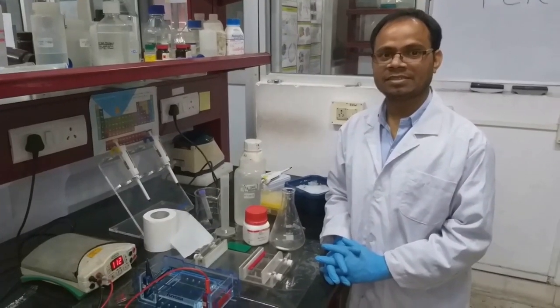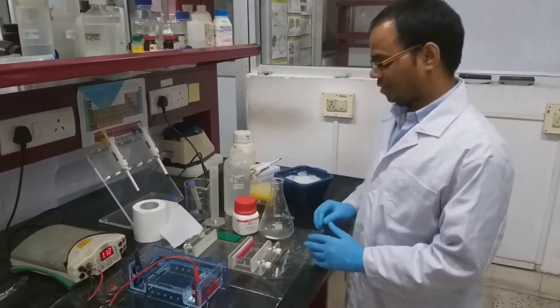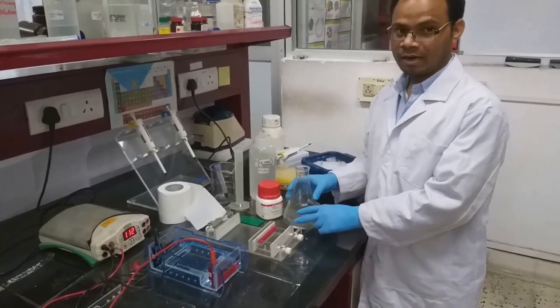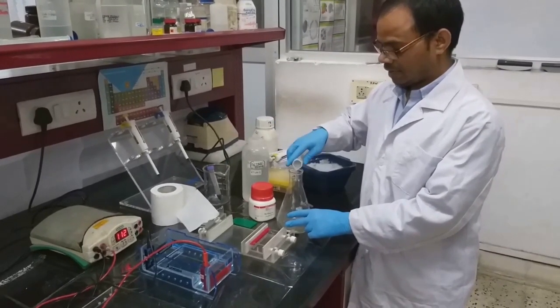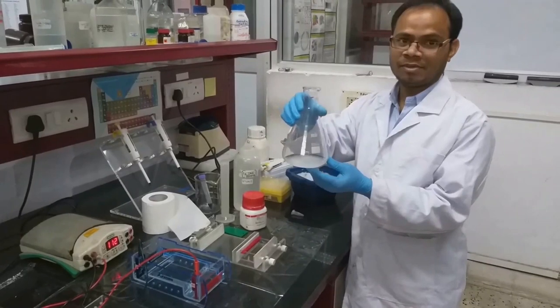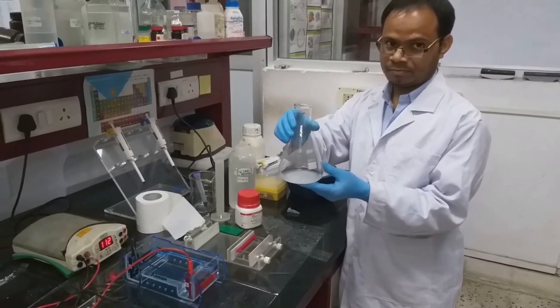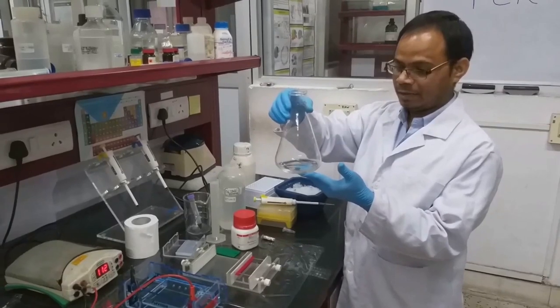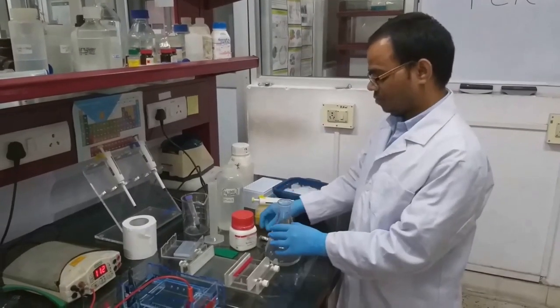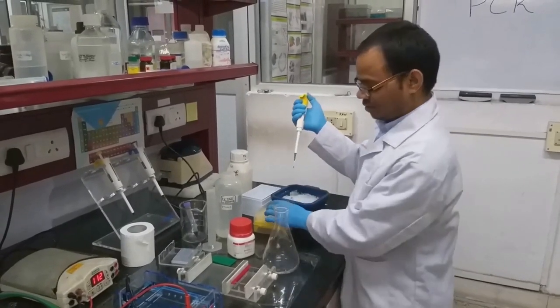Once the PCR reaction is completed, we have to analyze the results for amplification. For that, we need agarose and TAE buffer. First, we have to weigh the agarose and mix it with the TAE buffer. It will not dissolve easily, so we have to heat it in a microwave oven until it gets dissolved. Now, agarose got dissolved in TAE buffer. We have to let it cool down to 50 degrees Celsius. Now, before pouring, we have to add ethidium bromide for detection purposes.